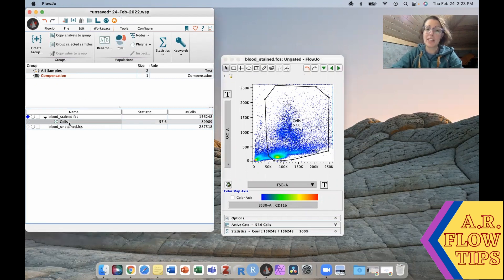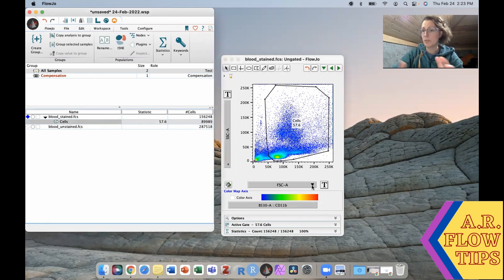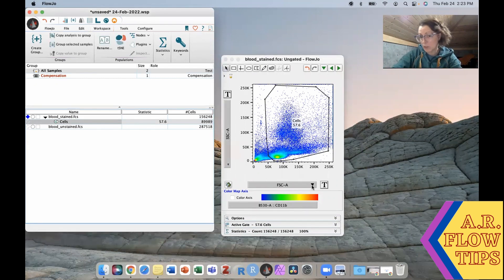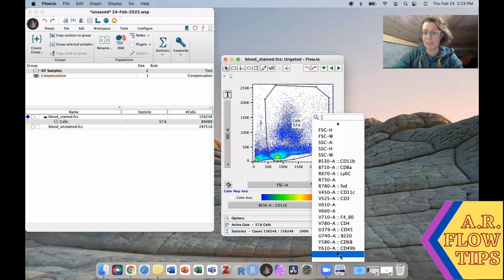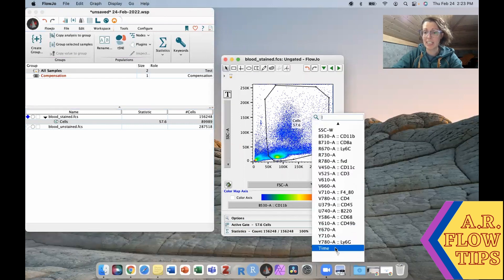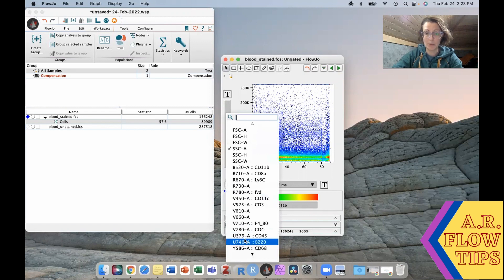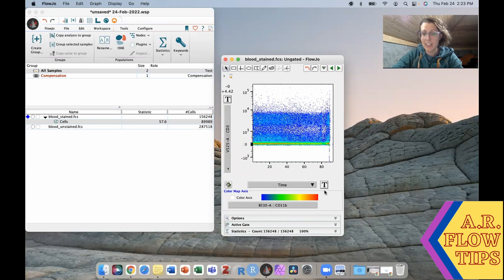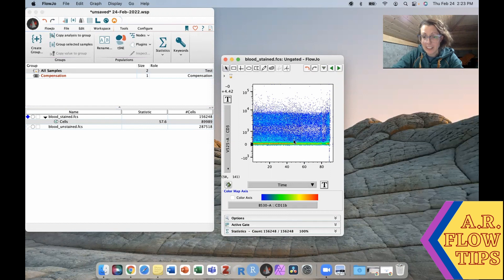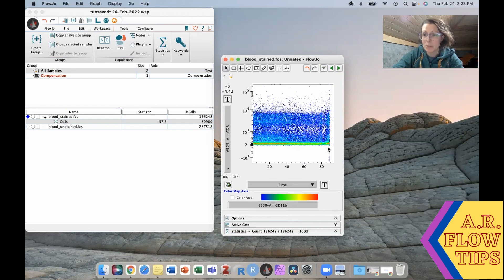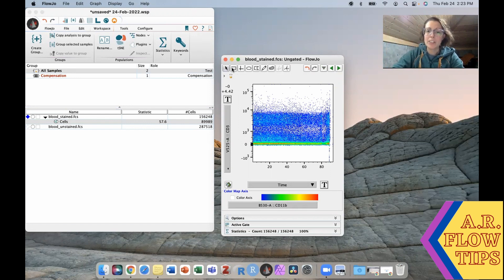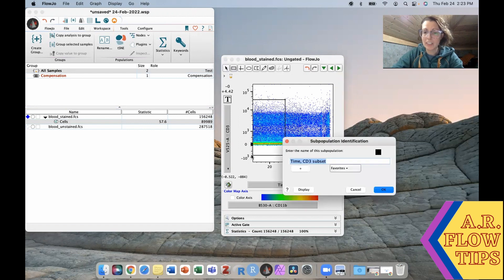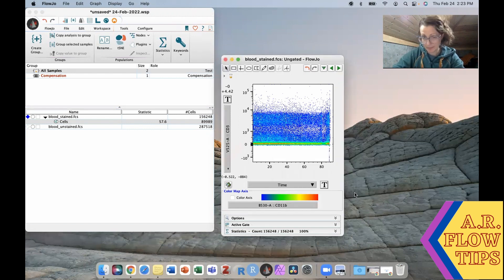From there we could go the old school way and do something like a fluorescence versus time. If we look at our fluorescence versus one of our parameters, say CD3, you can see we had fairly steady fluidics until kind of about this point. You can see it gets a little bit jumpy, there's a few humps, bumps, holes, whatever you want to call them. So classically you would then just gate on the portion that looked good and analyze that data.